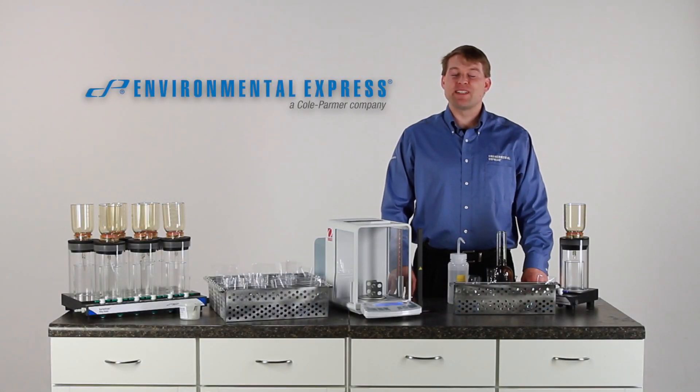Hello and welcome to Environmental Express Tech Tip videos. My name is David and today we'll be talking about total dissolved solids or TDS by standard methods.